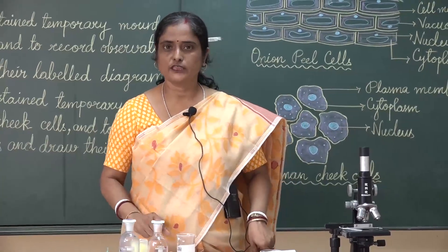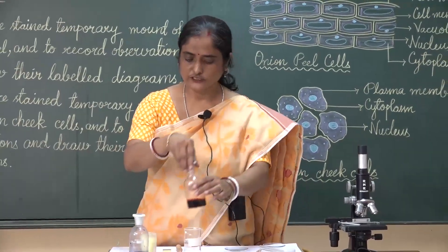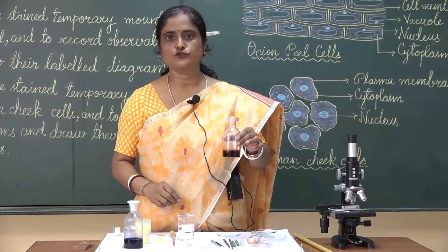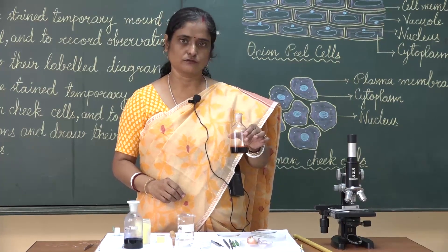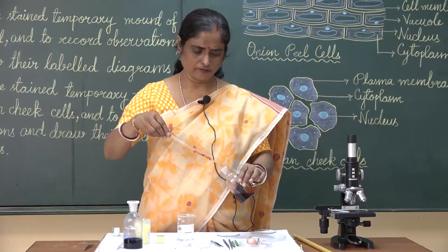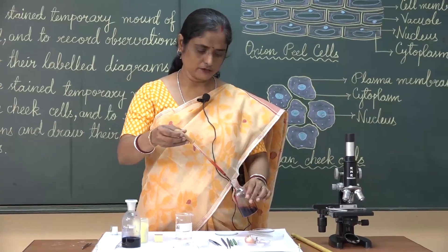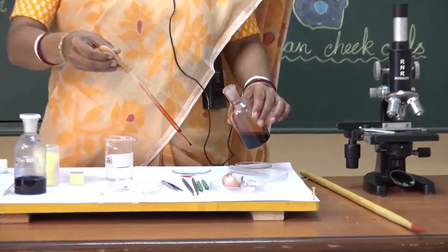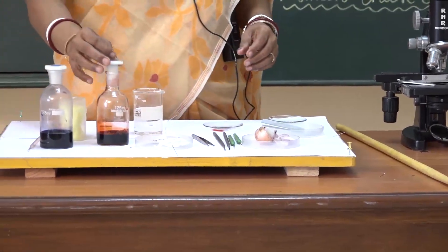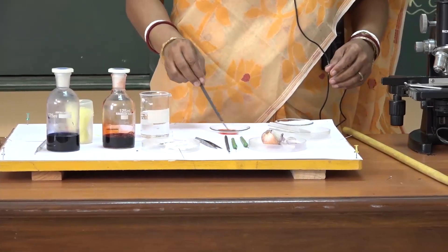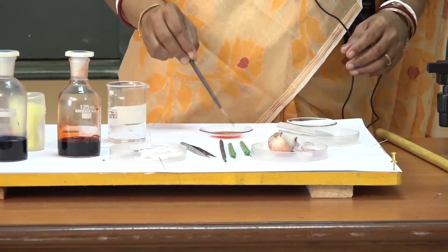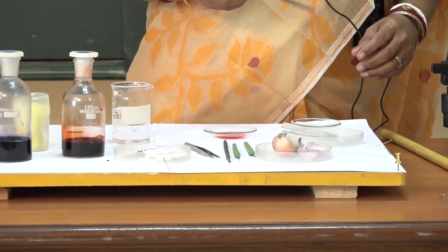Now we need to stain the material. This is the stain which is called Safranin, and this stain is required to stain the plant tissues. Take only a few drops of stain — just a few drops is enough. Let the peel take up the stain and wait for a few seconds.